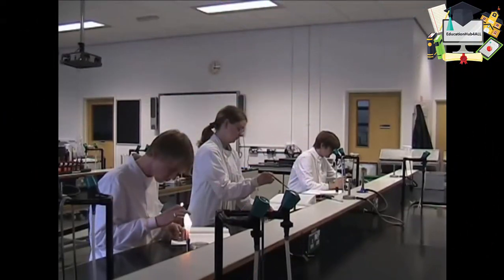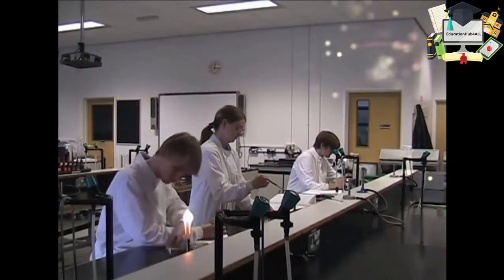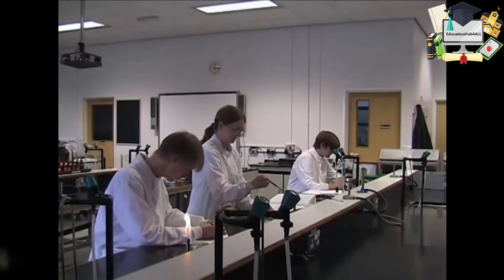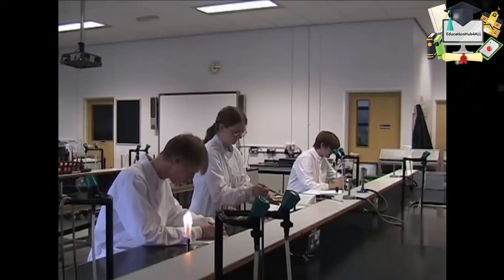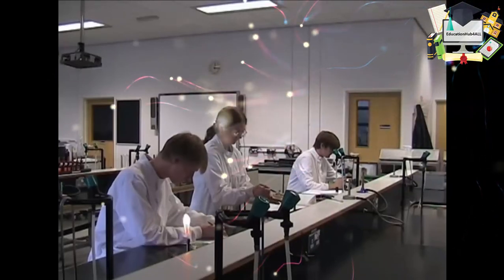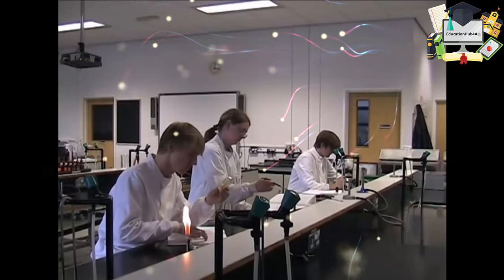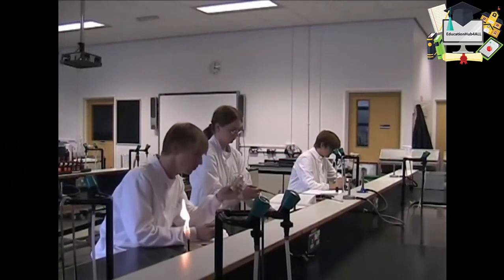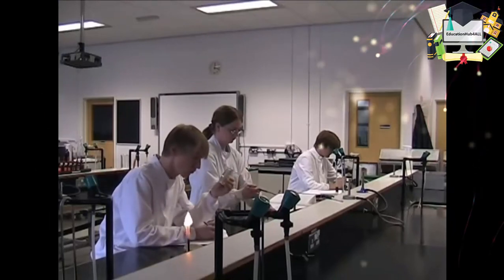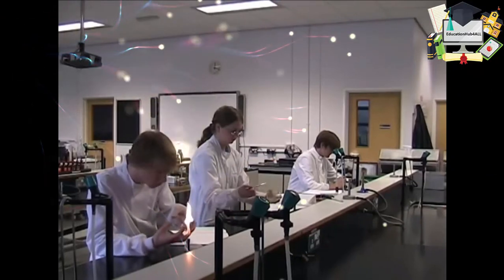In addition, you'll be needing to take notes during the practical. Leave a space to write notes, and remember, you never ever put a plate on top of a lab book. If your lab book's contaminated, we autoclave it to destroy it. Remember, microbes are invisible, and you don't want to risk any contamination. Jane is now going to show you how to work with and handle liquid cultures and solid cultures, containing the cultures in the tube, protecting yourself, protecting those around you, and protecting the sample from contamination.